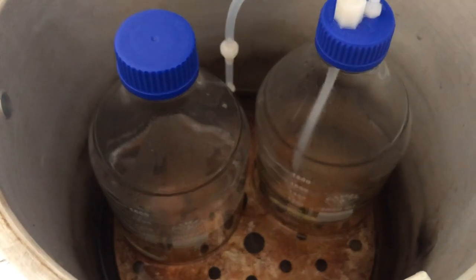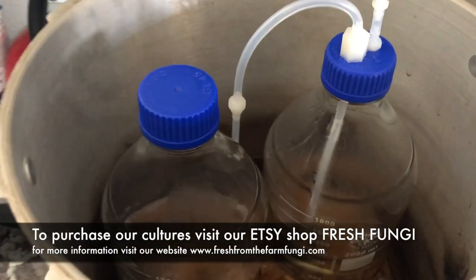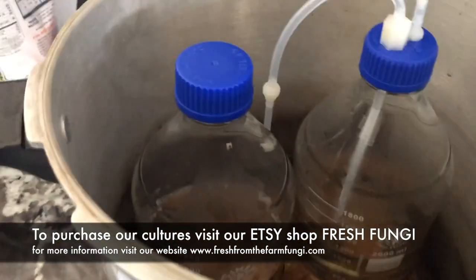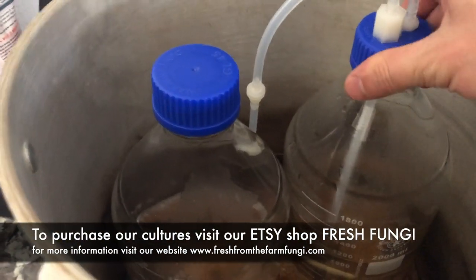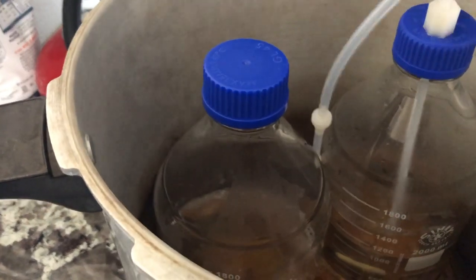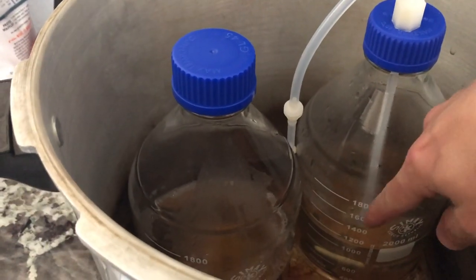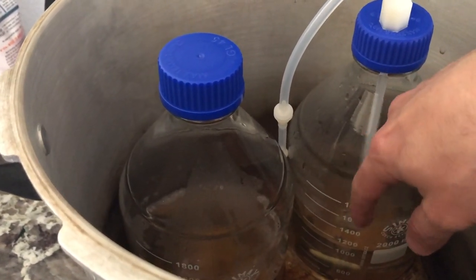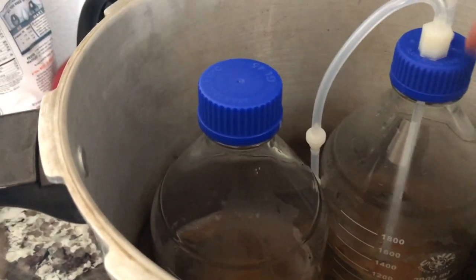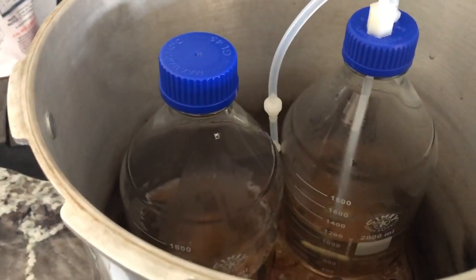All right, so I've got my 2-liter media bottles loaded up in the Presto pressure cooker for sterilization. I'm going to sterilize these for 20 minutes and make sure that these are backed off a little bit so that it doesn't build pressure. You could probably get up to 1600 mils in one of these bottles, but I don't need that much, so I'm just going to use 1 liter.